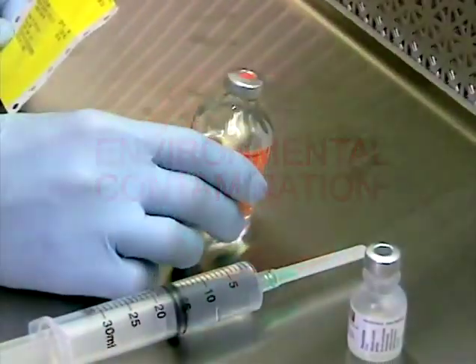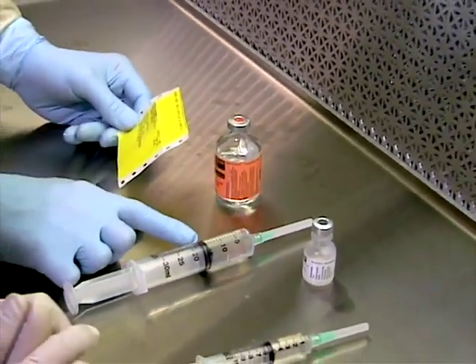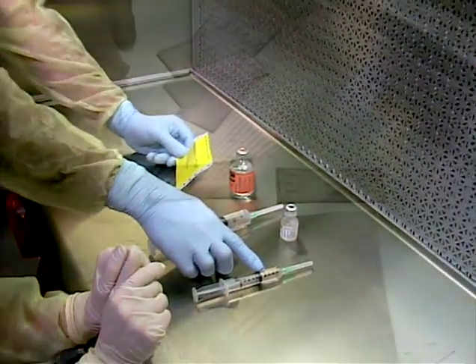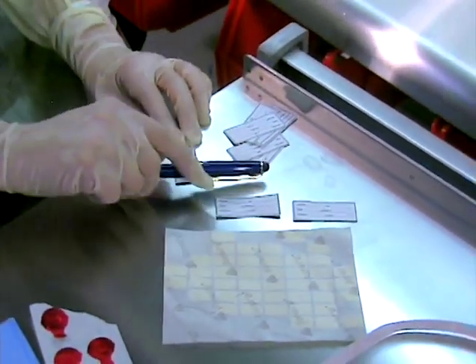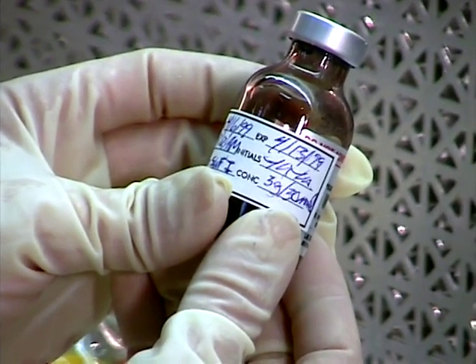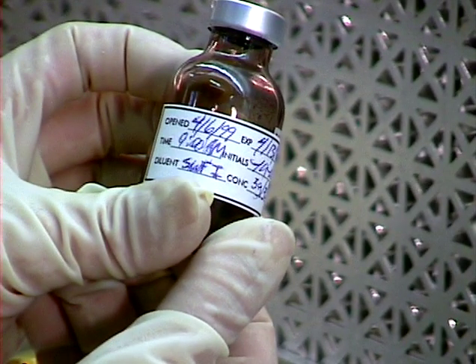Have a pharmacist verify the plunger position and check the vial label against the order prior to injecting drug into the final container. For multiple-use vials, if drug remains in the vial, prepare an ID label, which should contain the date of opening, pharmacy use expiration date, and the initials of the operator on a sticker, and place it on the vial. For reconstituted products, the type and amount of diluent and the final concentration should also be included on the ID label.